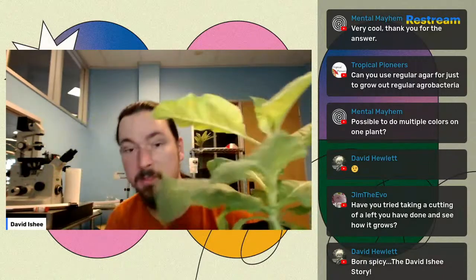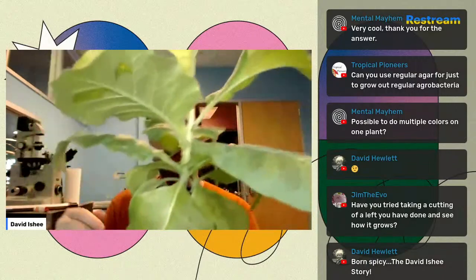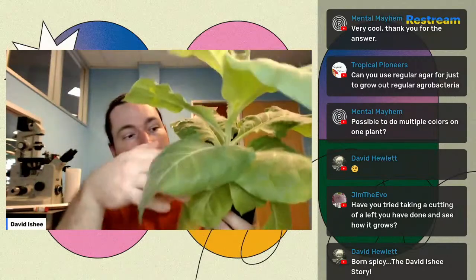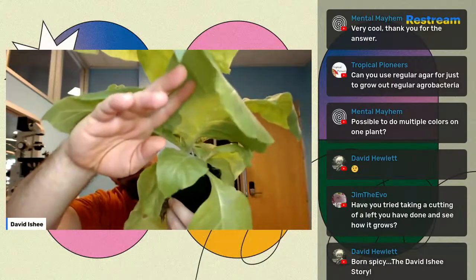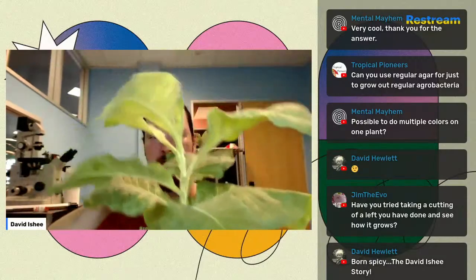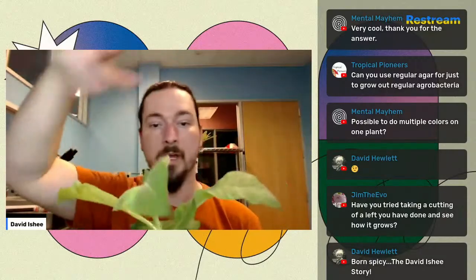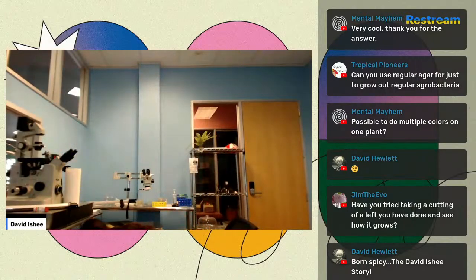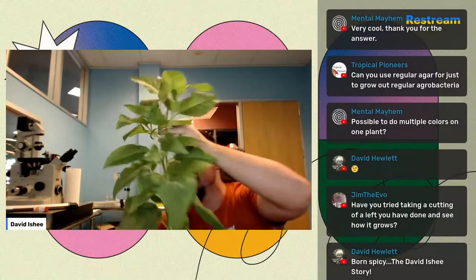So this other plant's a good example of that. You can see this one's just from a seedling, right? So it's just like a plant. There's another little plant here. It's actually two seeds that wound up in the same thing. But otherwise, it's just one stem, growth tip, bunch of leaves. And that's the normal pattern of growth for tobacco. You see, this guy's a little different.